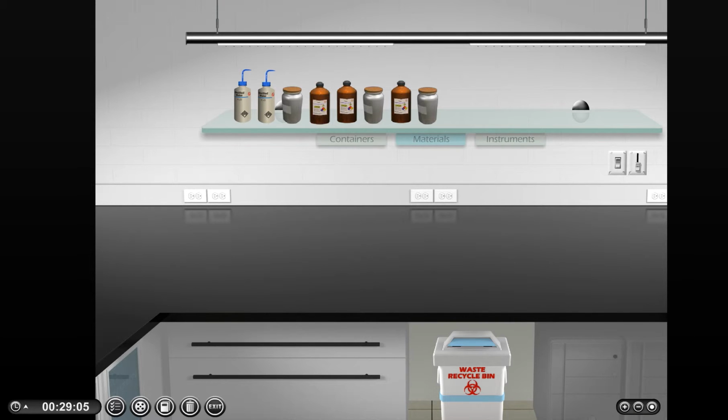In the case of today, a nickel chloride and sodium hydroxide reaction will produce a nickel hydroxide and sodium chloride product, exchanging both components in the final products.